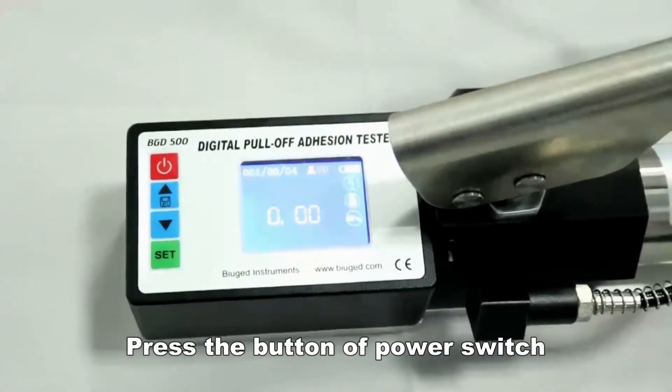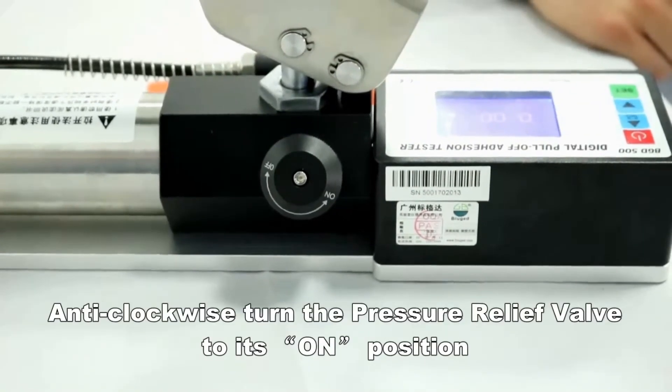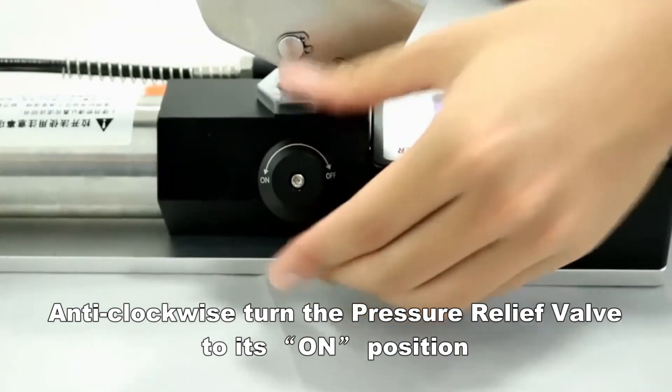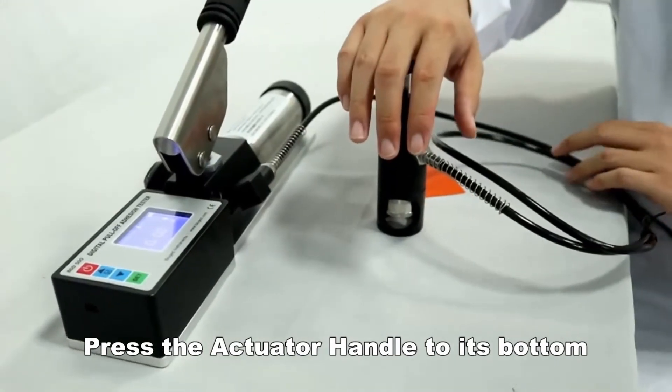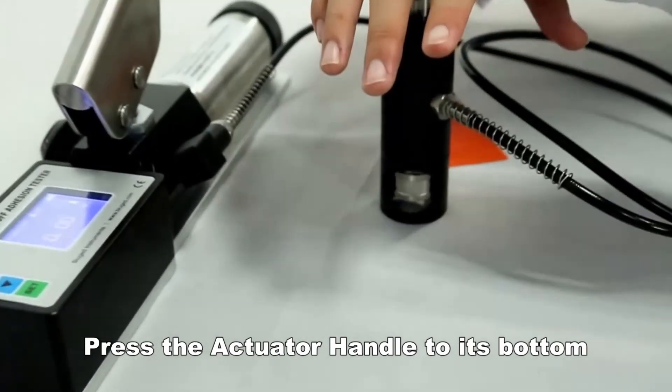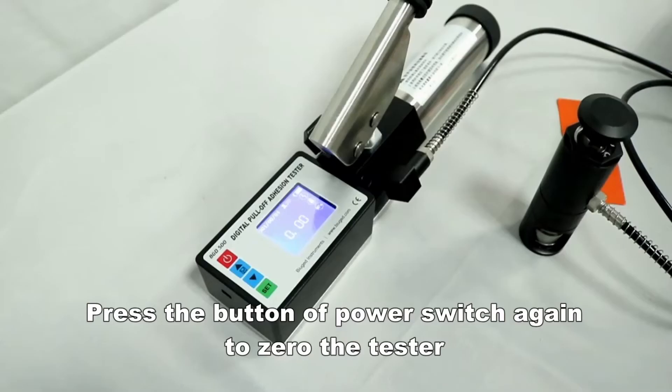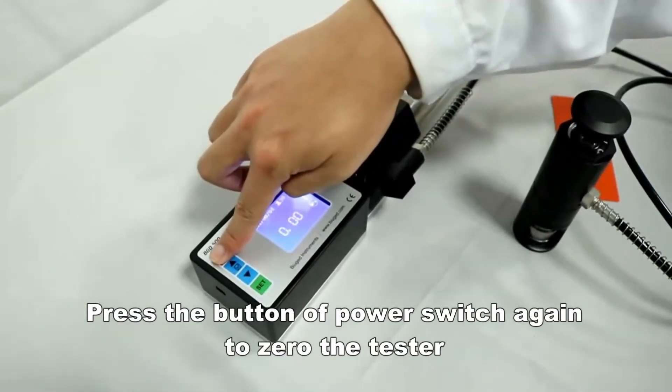Press the power button. Anti-clockwise turn the pressure relief valve to its on position. Press the actuator handle to its bottom. Press the power button again to zero the tester.